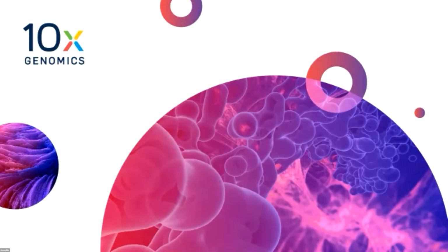Absolutely. And I'll try to keep it as brief as possible so that you may be able to take off. The spots, you're correct, they are not single cell. They're 55 microns in diameter, so we say it can be anywhere from 1 to 10 cells, depending on the size of your cell. If you're working on large neuronal cells or other large cells, it could potentially be 1 or 2 cells per spot. If you're working with small immune cells, it could be 10, 15 cells per spot. So you're correct, which is the reason why a lot of people are merging single cell data with Visium data to try to infer or deconvolute more of that spot information. But to be completely transparent, it is an informatic approach, and there are potential limitations to that.